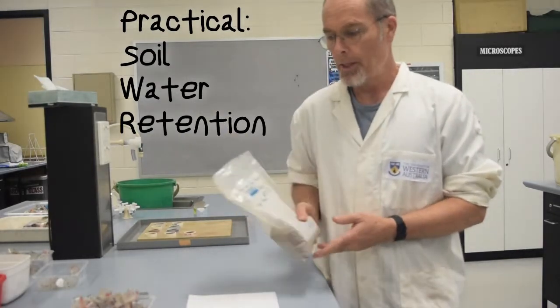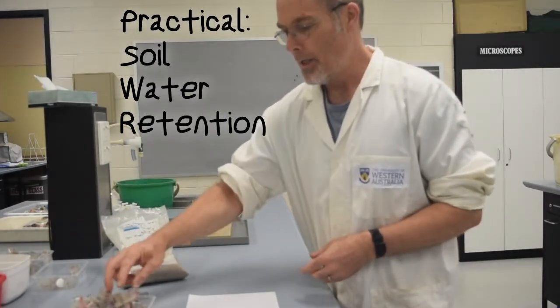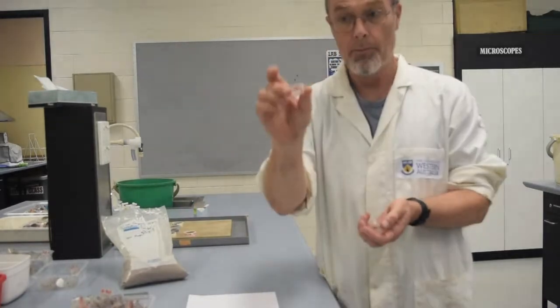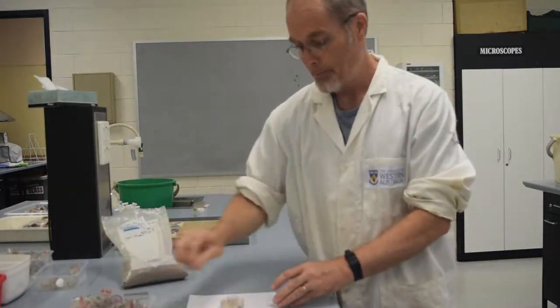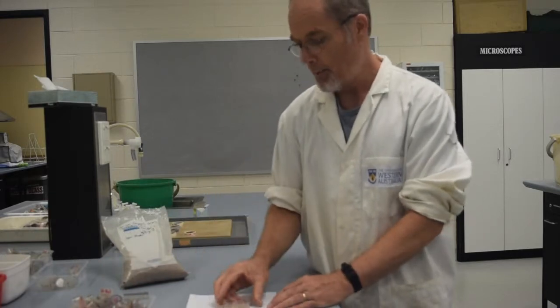So remember your horizon composite sample. The first thing we do is to weigh out seven identical samples using these small vials. We need seven of these — you need to weigh them first and record the weight of them all en masse, and then we're going to arrange them on a sheet of paper like this.